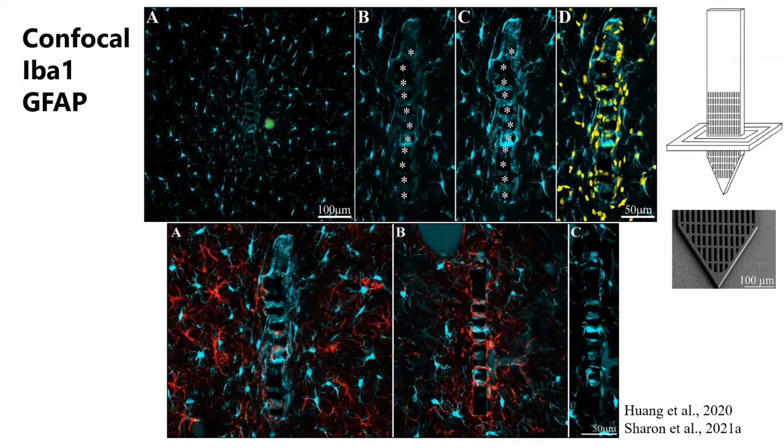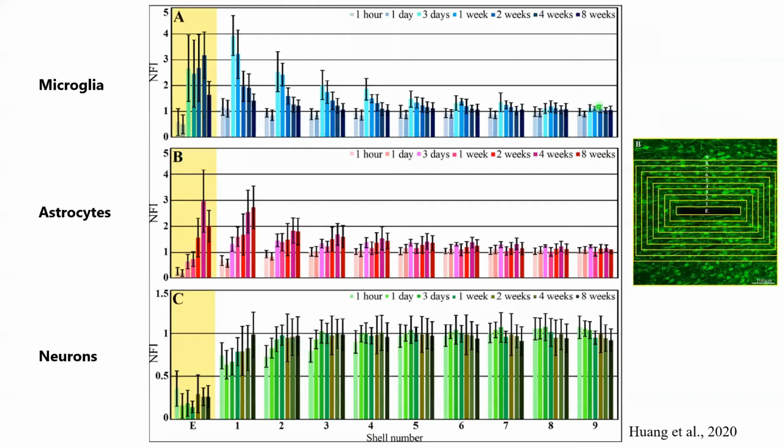But as I described earlier, other groups had to extract the platform prior to sectioning and disturb this interface. Another problem is that what you see here is the resolution of a confocal microscope image. And only by increasing the fluorescent intensity and co-labeling microglia with DAPI for nuclei, we further revealed the vast number of microglia cells attached to the platform. This is important information most of the research groups investigating the platform-brain interface entirely miss.